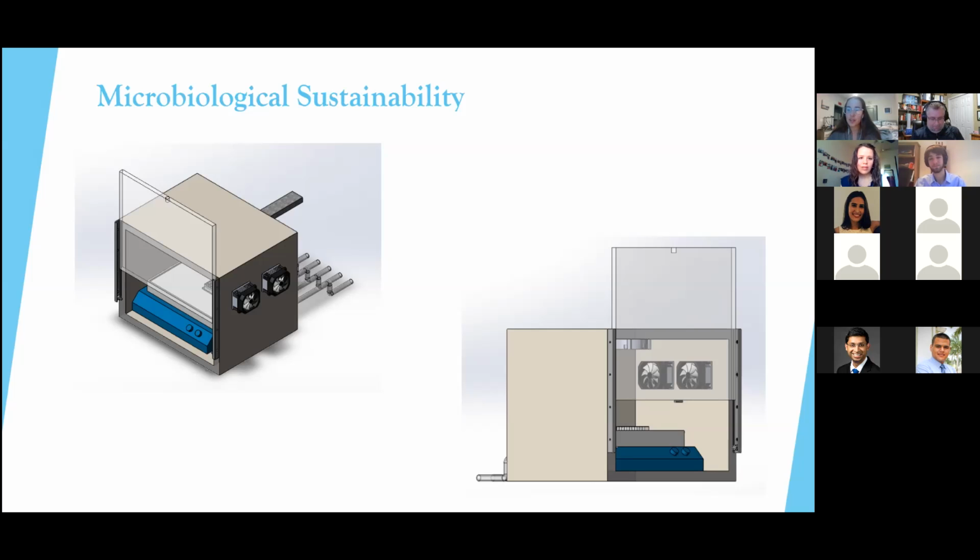And that's an understandable statement. That's just one of the oversights and downsides of having mechanical engineers design something that belongs in a biolab. We didn't really think of that because we're coming from a mechanical perspective where we routinely go in and check our devices and make sure everything's still properly tightened. So you don't happen to think this is a mechanical device? On some terms, yes. So I guess the build of it, yes, it is a mechanical device.